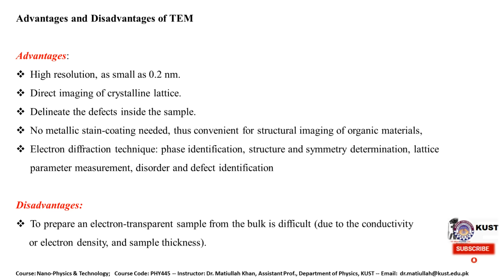No metallic coating is needed. This is convenient for structural imaging of organic material. An electron diffraction technique is used to identify the phase, structure and symmetry, and the lattice parameters are also measured. Similarly, disorder and defects are identified with the help of TEM.